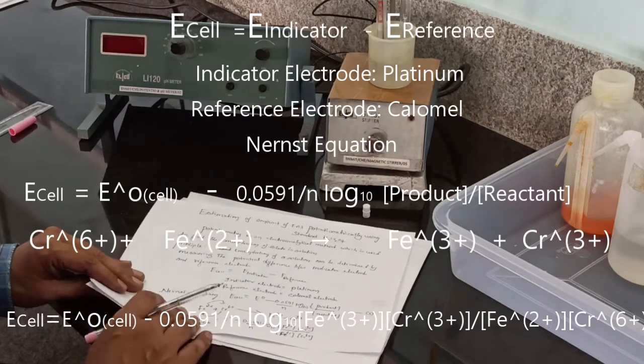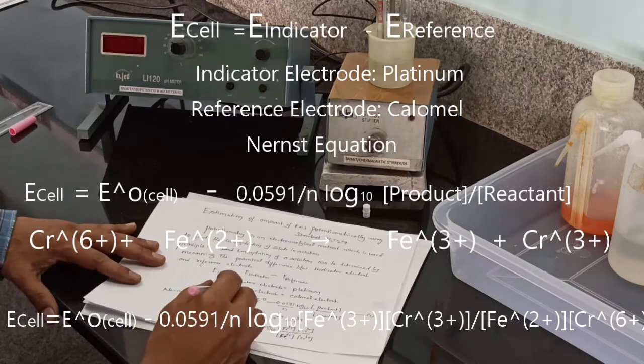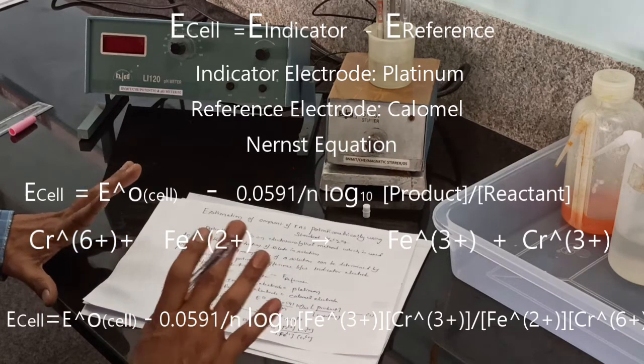If you write the Nernst equation, E cell equals E naught minus 0.0591 divided by n into log base 10 of concentration of product by concentration of reactant. In the beginning, the EMF of the cell changes gradually due to change in the ratio of concentration of product and concentration of reactant. At the end point, the EMF of the cell changes rapidly.